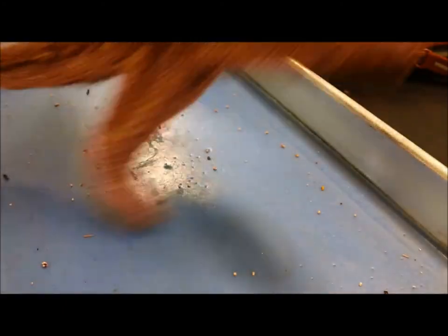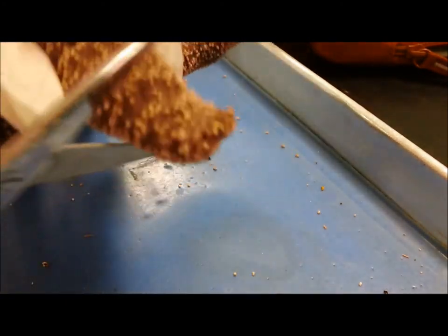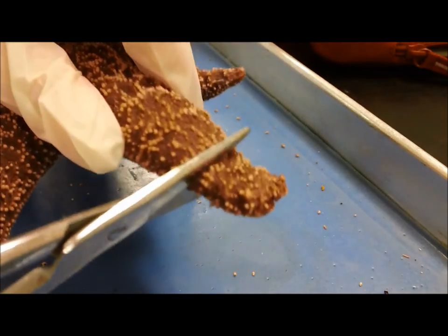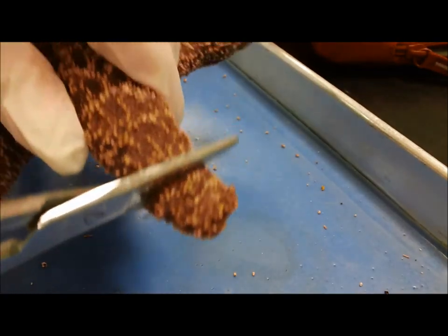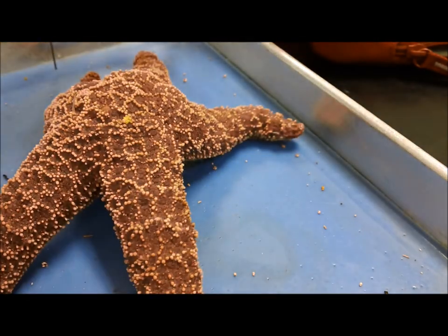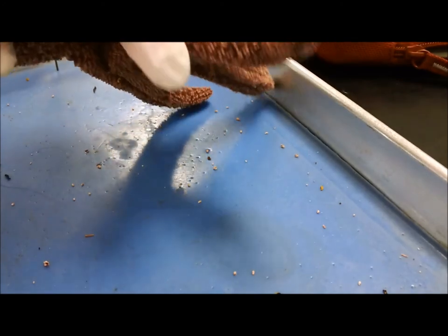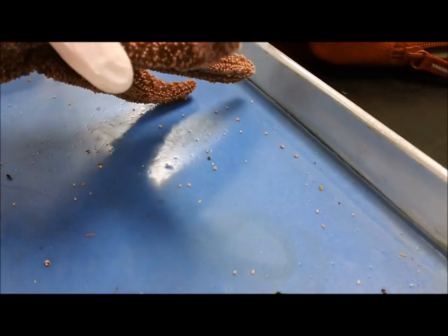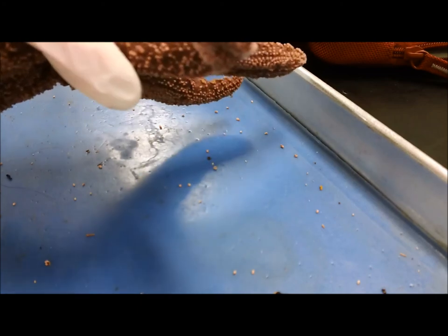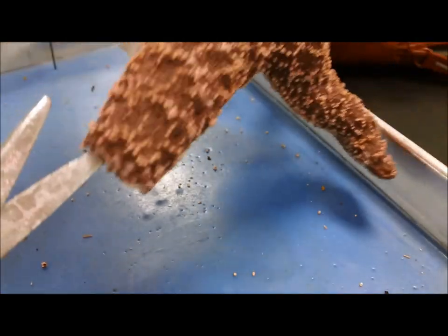So now we're going to look at the internal anatomy. We'll cut off the bottom right here, and then cut off the sides. The skin is very tough on echinoderms — it's kind of their big thing.